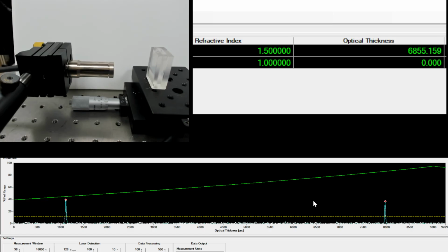Now you can imagine this would be useful if you had a tube with a known ID and fluid flowing through it, say in a mixing process. You could actually monitor it in real time in situ as saline is being mixed.